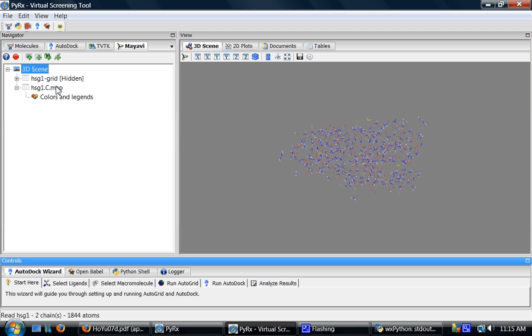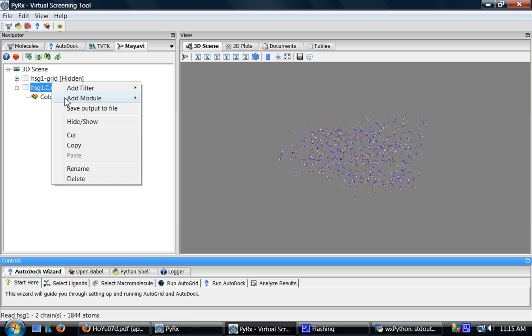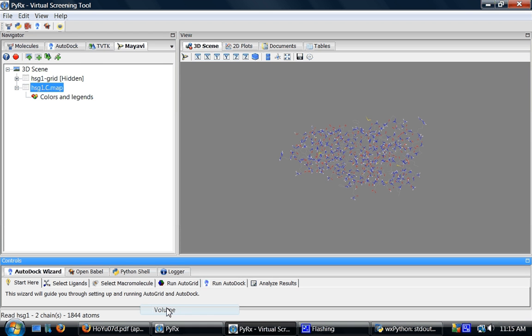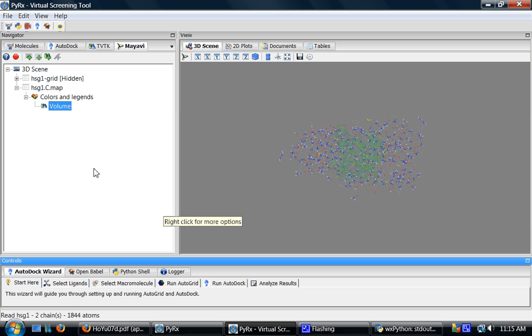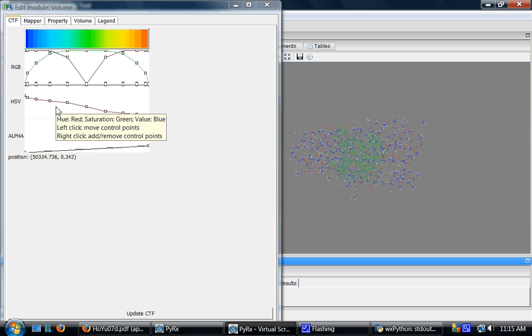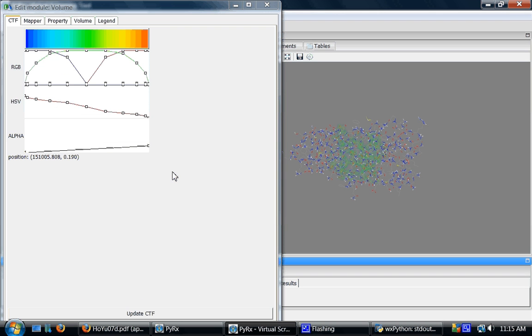I'll select this surface and go to add module and select volume this time. This does the volumetric rendering. I'll double click on this volume object which will bring me a parameter panel that I can use to control this volume rendering.